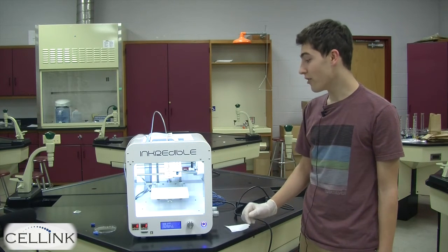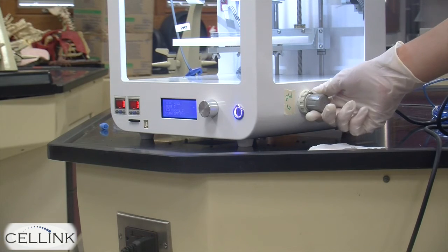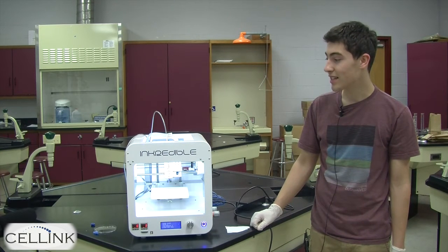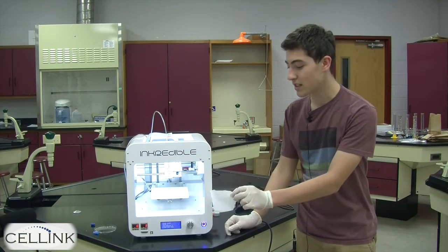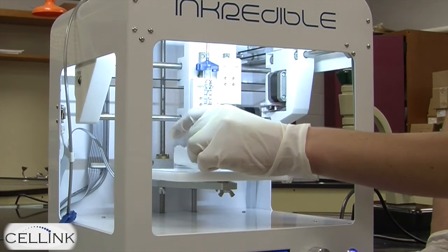To adjust the amount of pressure that print head one is receiving, you're going to pull out the gray knob on the right side of the bioprinter and twist it until you see bio ink being extruded from the print head. Before you do this, place a small piece of paper towel over the petri dish to pick up any excess bio ink.